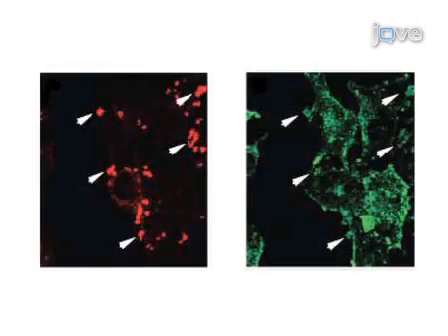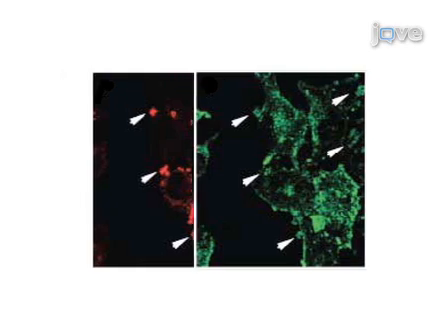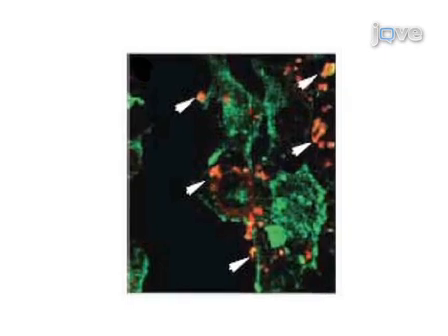Shown here are representative confocal imaging results of human brain endothelial cells infected with meningococci for 8 hours. The location of bacteria is shown in red, while the location of α-actinin is shown in green. Arrows indicate regions where a high degree of α-actinin accumulation appears to have occurred around bacteria. In this overlay image, there are several regions in which yellow-orange colour appears, suggesting co-localization between meningococci and α-actinin.